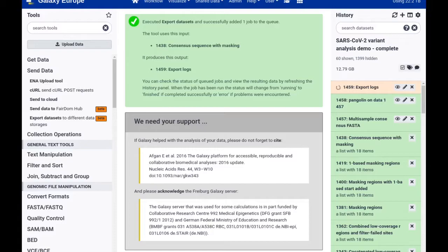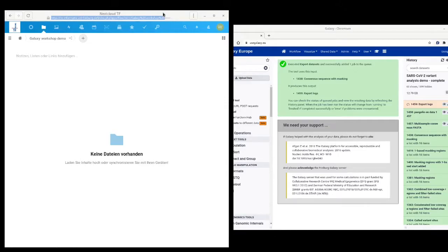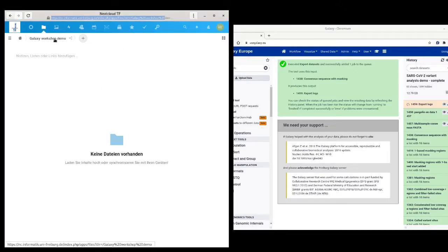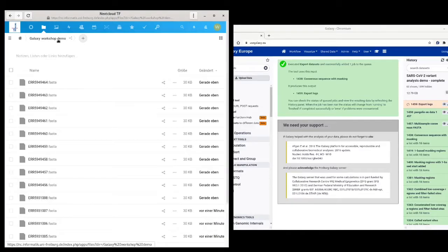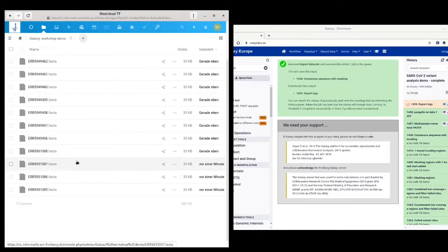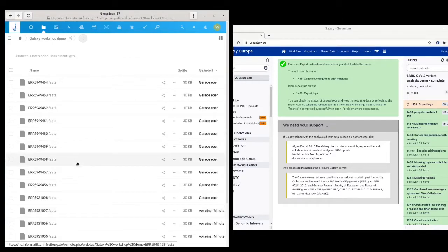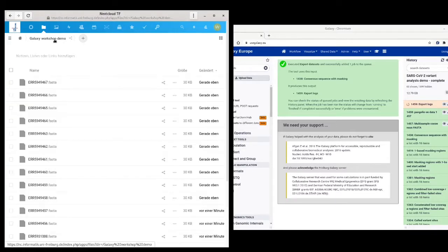And while this job is running, let's head over to my Nextcloud web interface and I should see those datasets come in there now. So I'm inside my Galaxy workshop demo folder and now I can just refresh that page. And then in fact all these FASTA files are coming in. A few of them have been transferred already. More will probably come in soon.